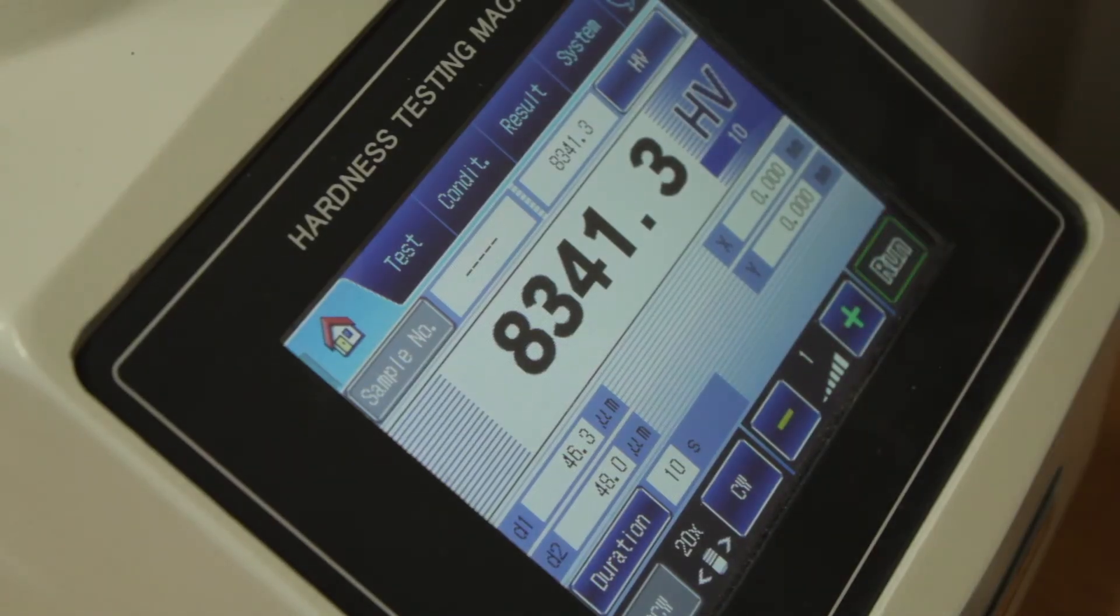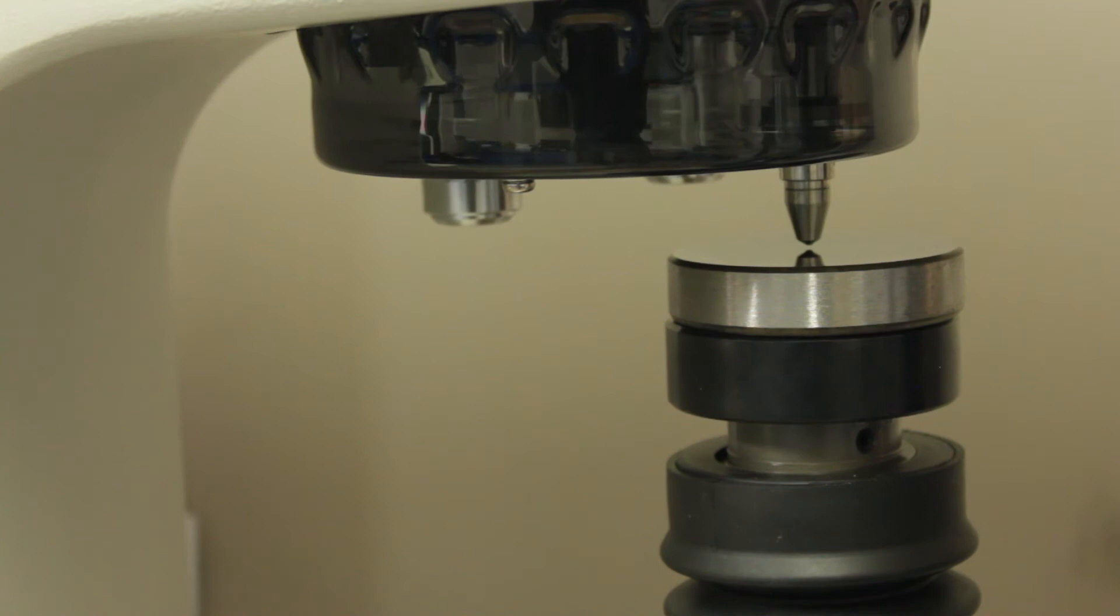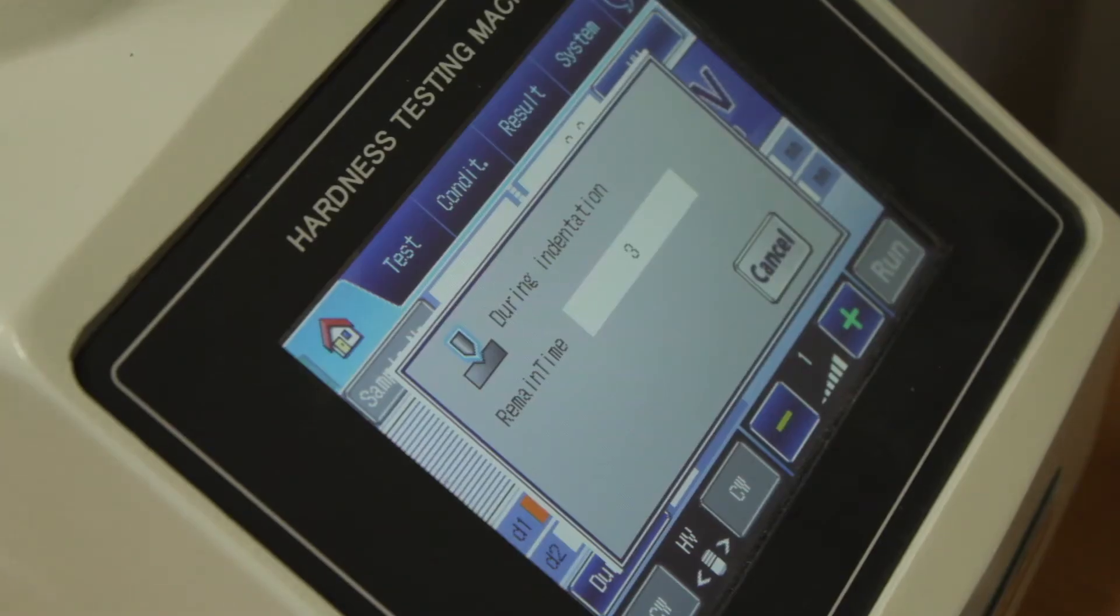Next, hit the run button. This test is shown on a separate calibration sample. The diamond probe will engage with the test piece and there will be an indentation dwell time as set in the control.